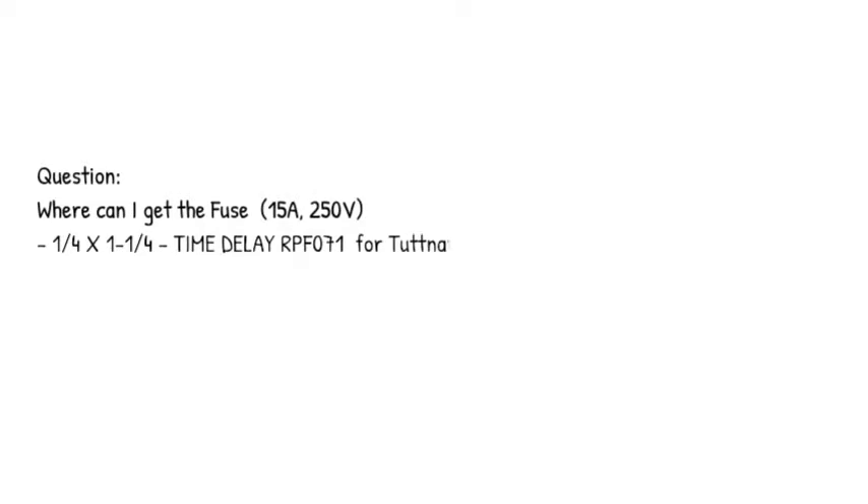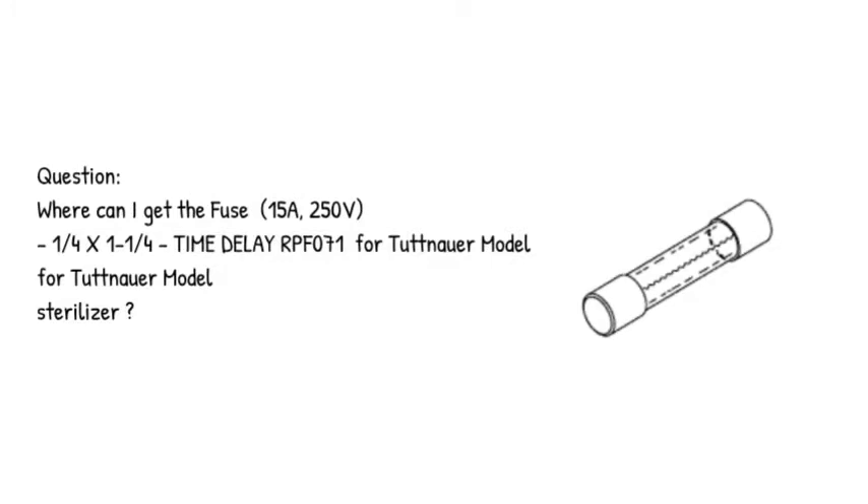Question: Where can I get the fuse — 15A, 250V, 1/4 x 1-1/4, time delay RPF071 — for the Tuttnauer model sterilizer?